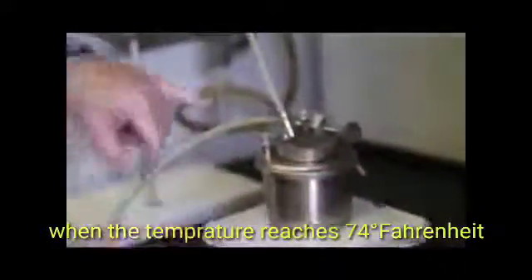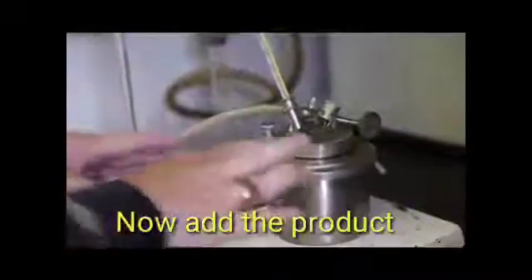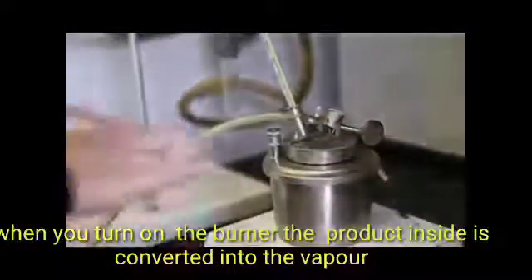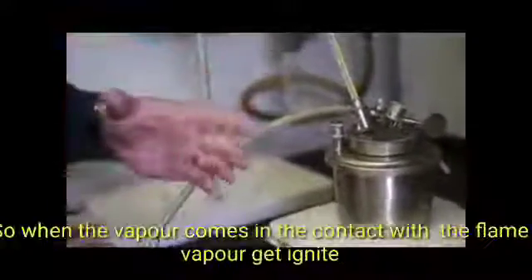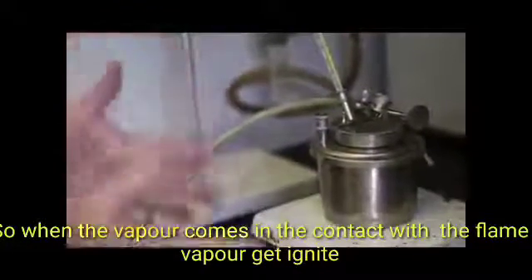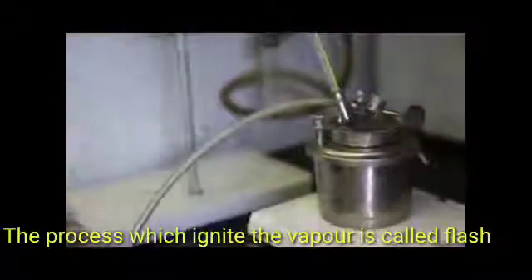There's no heat on this whatsoever — the temperature is right at about 74 degrees Fahrenheit. The only thing we've done is put the product in there. We're going to turn the flame down into a closed space. The vapor is building up in there, and when that trap door opens, the flame will jump down in there and if there's any kind of vapor it'll ignite the vapor and cause what they call a flash — so that's at room temperature.